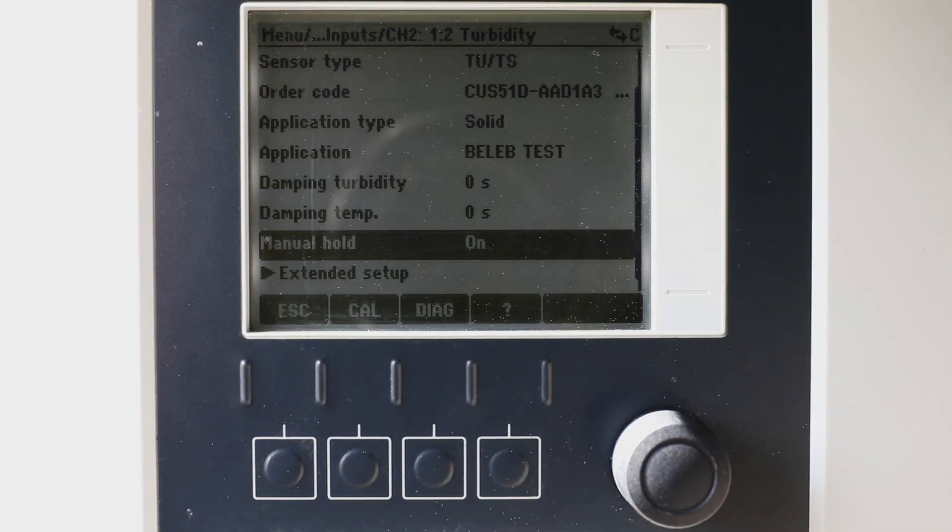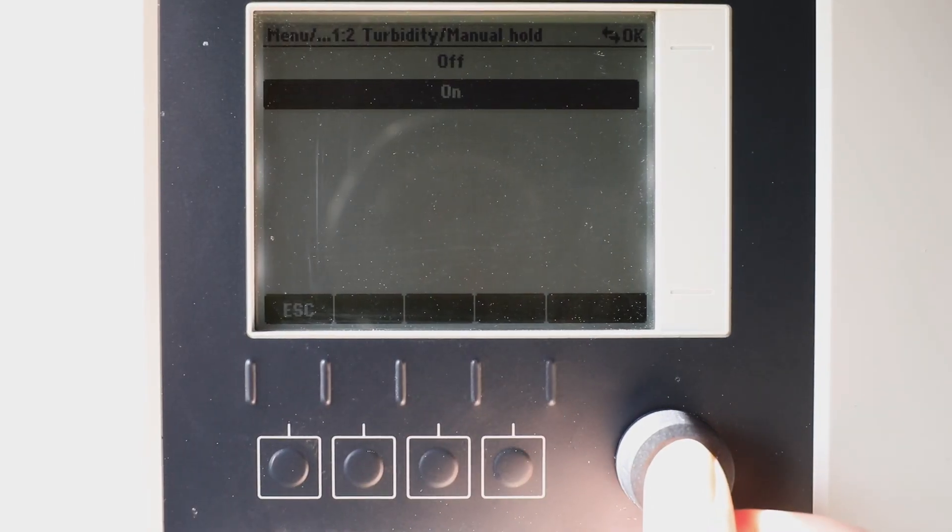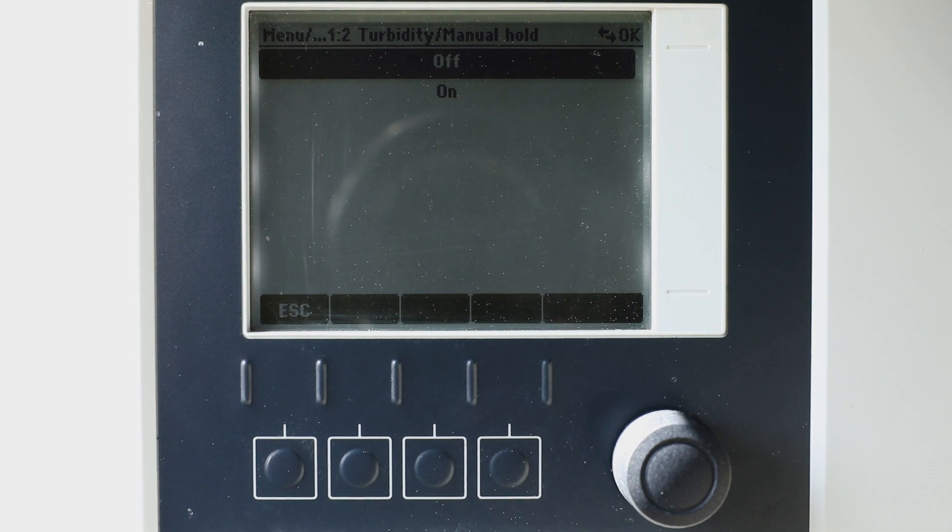After every cleaning, rinse the sensor with plenty of water before you put it back into operation. And don't forget to deactivate the manual hold to release the measurement output.